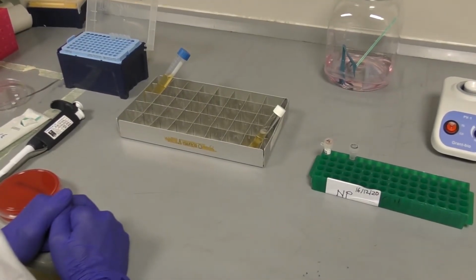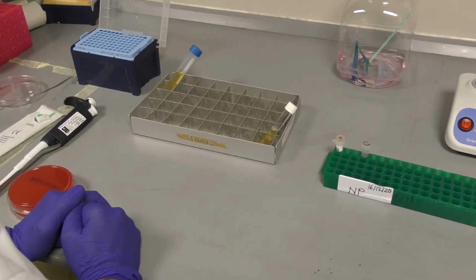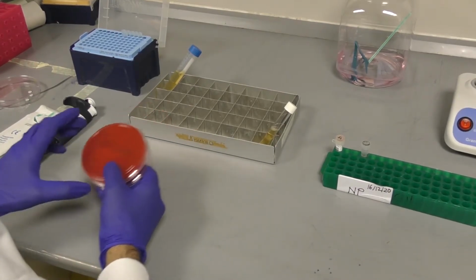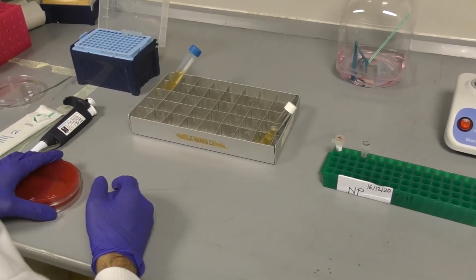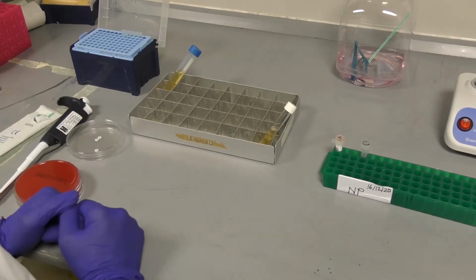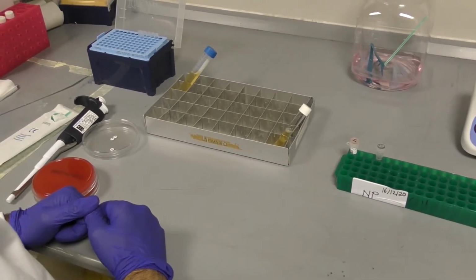We're now going to move on to the process that will occur after the 4 to 6 hour incubation period. Make sure that you have all the plates that you require brought to room temperature at this point. As we are going to process a nasopharyngeal specimen, you will need sheep's blood agar as well as optochin discs.